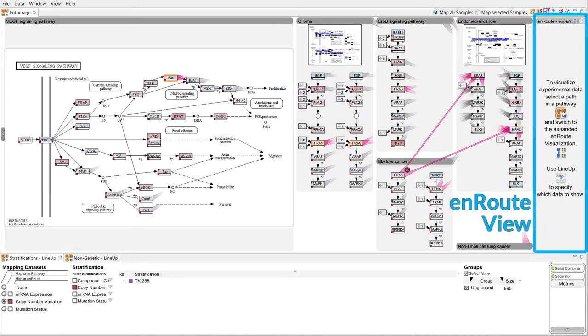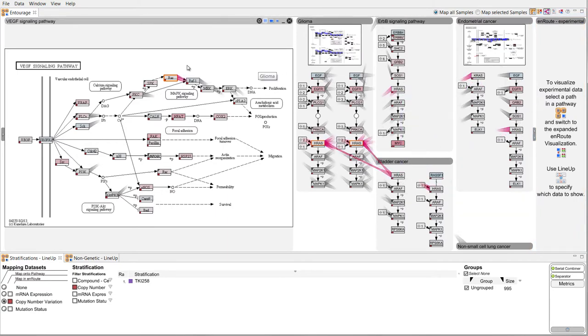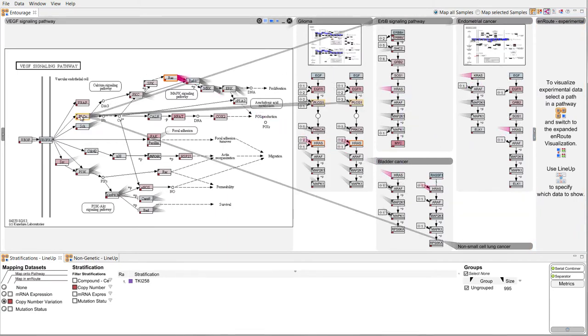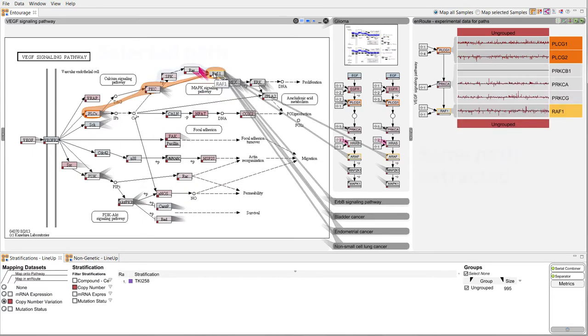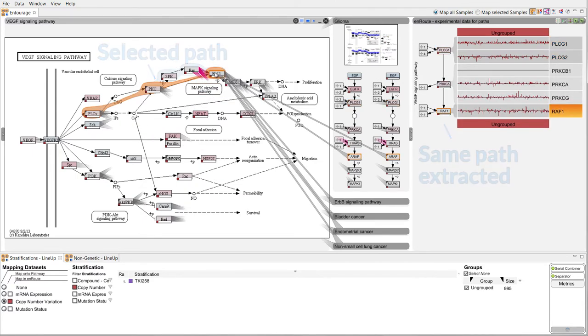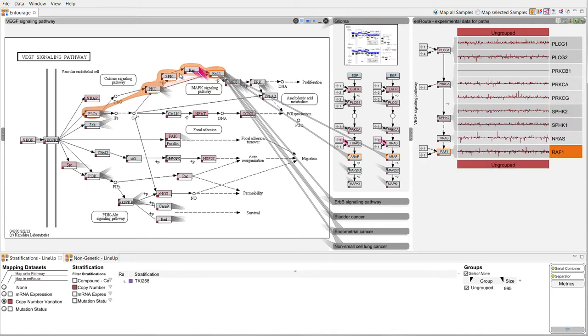A more detailed analysis, a comparison between conditions and the simultaneous analysis of multiple datasets is possible using the en route view. When we select a path it is extracted and shown on the right. When alternative routes between a start and an end node are possible we highlight them in different colors. We can easily switch between the alternatives.